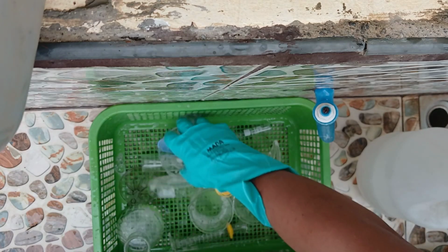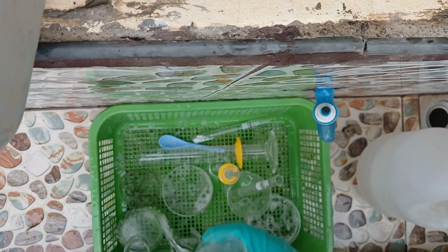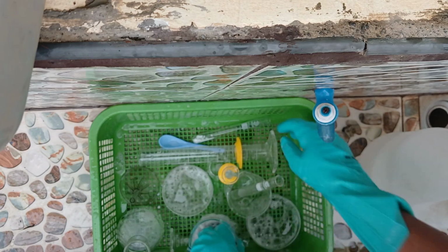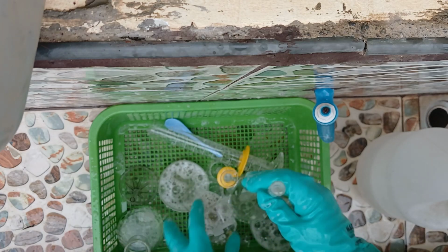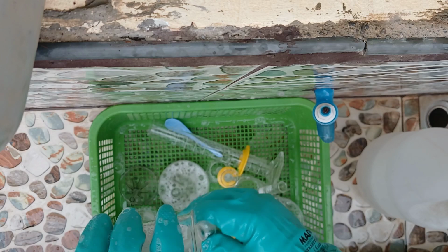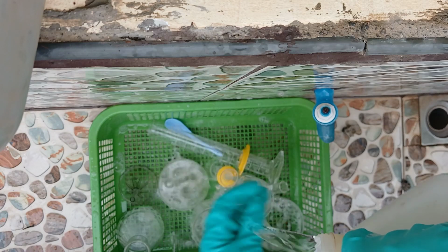To clean the glassware, you have to use liquid detergent, a white cloth, and clean water. The indication that your glassware is totally clean is that there are no droplets, when you observe the inside and outside of your glassware. So that's how you're going to clean glassware.